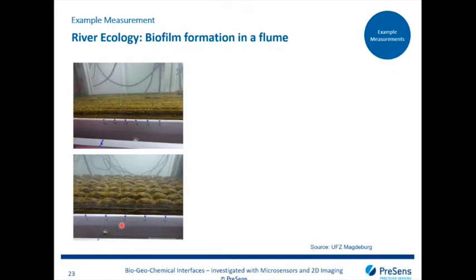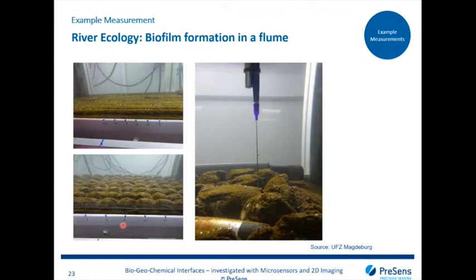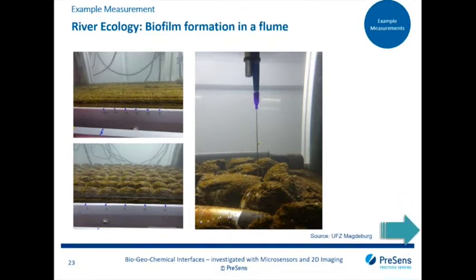You can see larger ones, we had even larger ones, and then the last scenario was actually with normal rocks taken out of the creek or river to see how biofilm formation was happening here under regulated flow conditions. Coming to the results, how was it done?